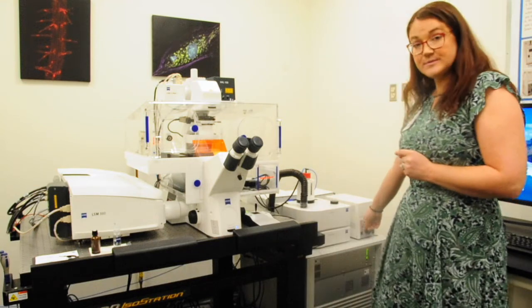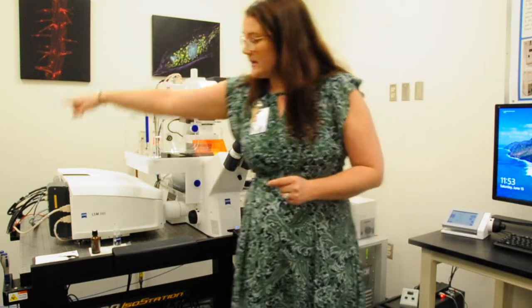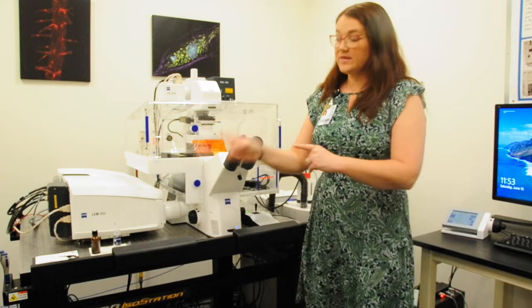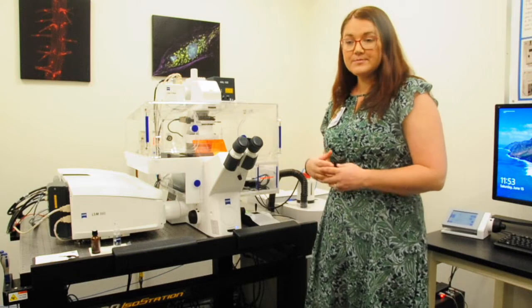So one of the big differences between a wide field and a laser scanning microscope is the scan head that we have over here. Behind me we have a large laser bench. The light from the lasers comes in through fiber optics, comes in through here, and there's an actual galvo mirror within that. It comes up into the objective, scans across our sample, like the name says, laser scanning microscope.